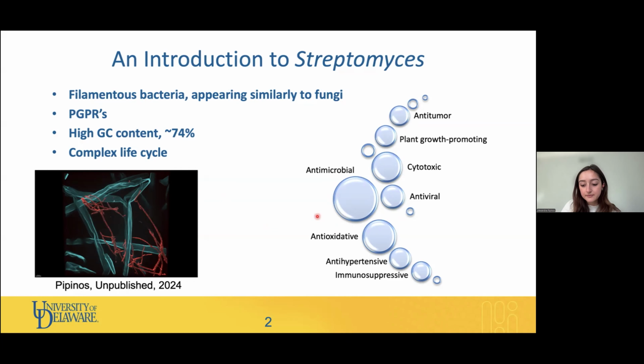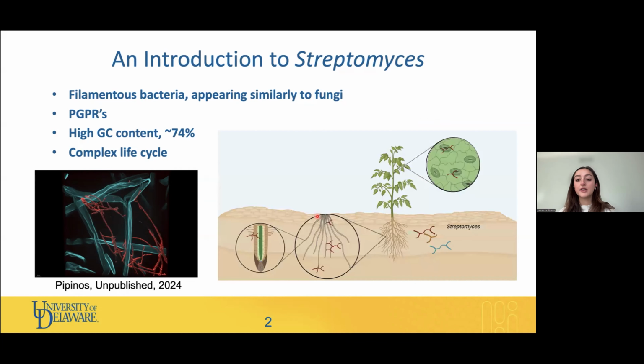Our goal was to inoculate Streptomyces coelicolor with spring wheat to analyze their colonization habits. Again, as I mentioned, this was just a part of my project. We wanted to, one, look at their colonization habits, and then also examine whether Streptomyces was acting as an endophyte. So is Streptomyces entering the plant through some sort of mechanism?